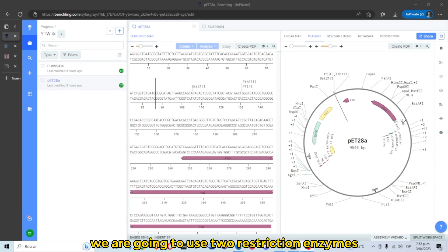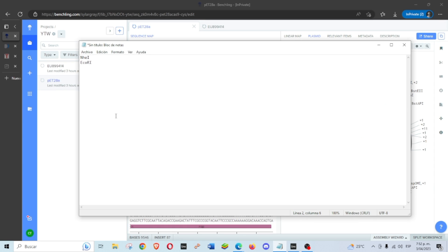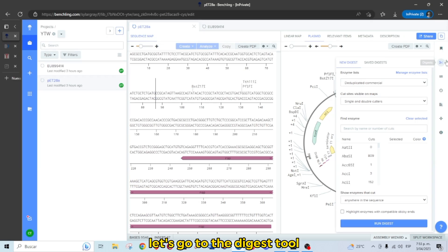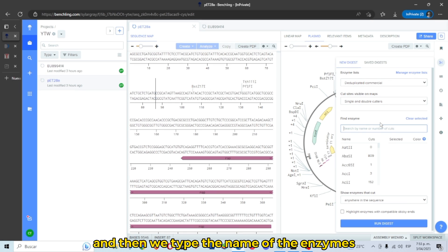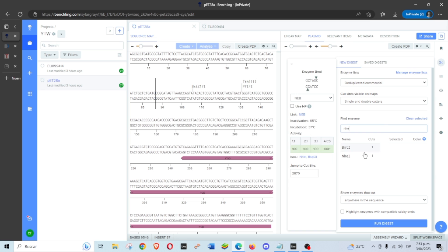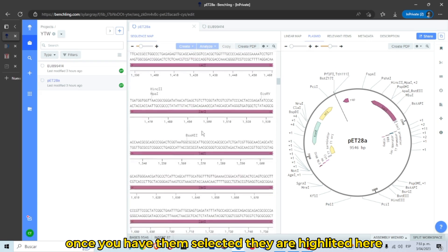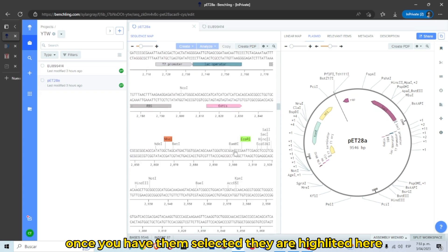We are going to use two restriction enzymes: NHE1 and ECO-R1. Go to the digest tool and type the names of the enzymes — NHE1 and ECO-R1. Once you have them selected, they are highlighted here.